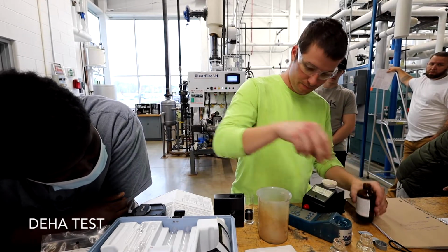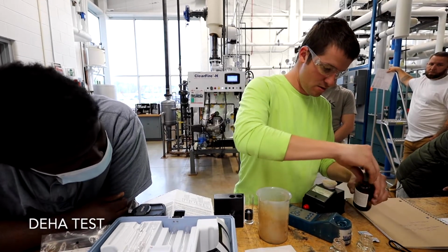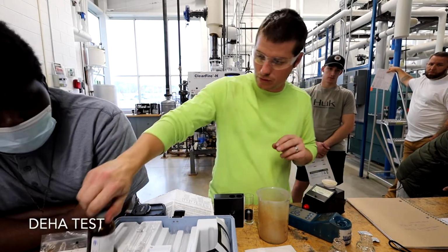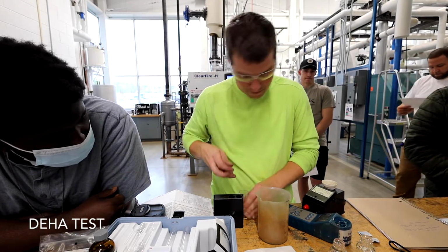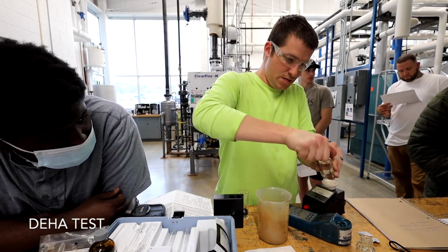All right, now let me cap this. Put that back. Okay, then I would do this again. Tap it, shake it. Yep.